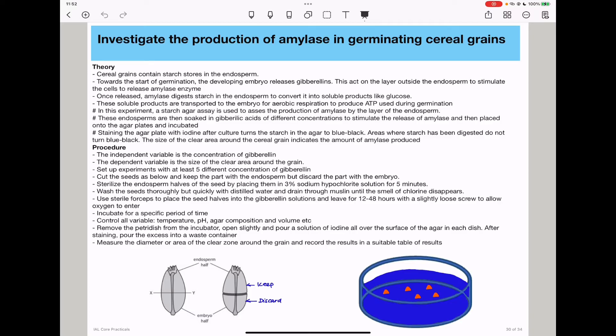We use a starch agar assay. We cut the seed in the XY direction, discard the embryo, and keep the endosperm. This allows us to control the concentration of gibberellin that the endosperm is exposed to, determining which concentration releases the highest amount of amylase. The endosperms are soaked in gibberellic acid of different concentrations to stimulate amylase release, then placed onto agar plates during incubation.